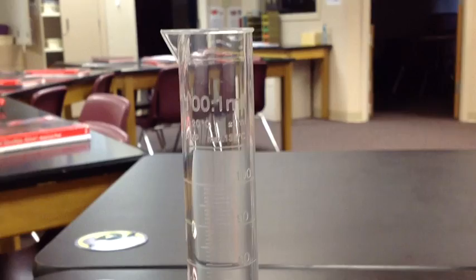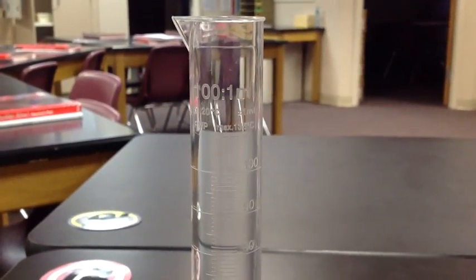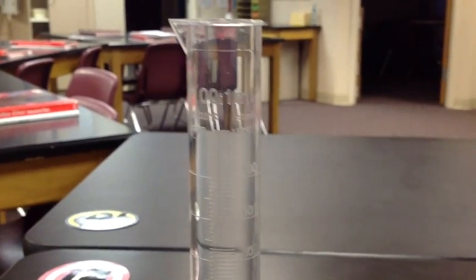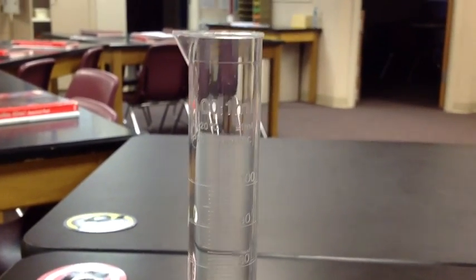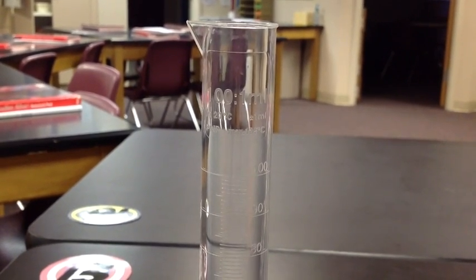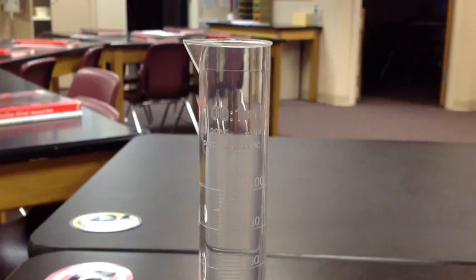So the first step is to fill this graduated cylinder with some water. Now when I say some water, it doesn't really matter how much you put in, as long as whatever object you're going to try to submerge goes all the way under the level of your initial water.